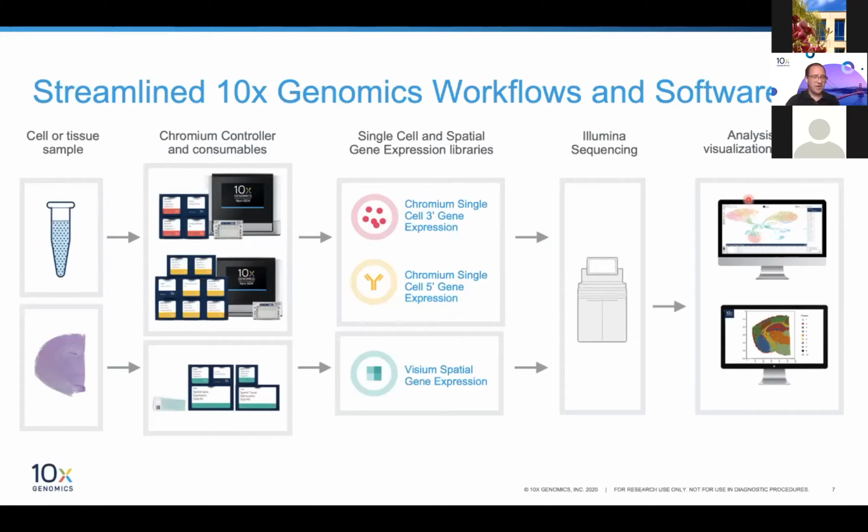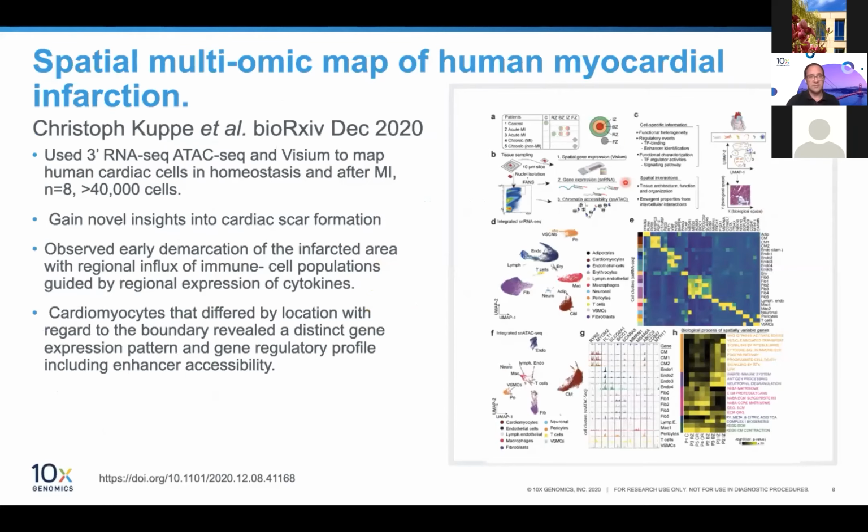Then what we're seeing is various publications now calling out their own analysis pipelines where you can bring those two data sets together. So for example, we have things like STARfinder, SPOTlight, and even some of the applications in Seurat are able to do this. So at the moment, we see this to be a really big trend.